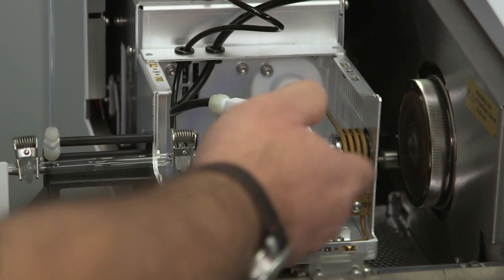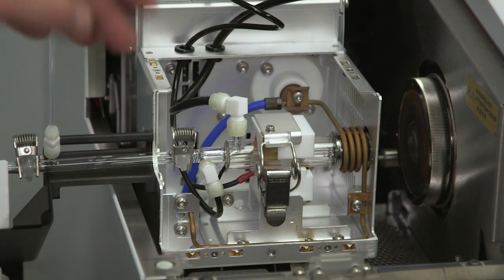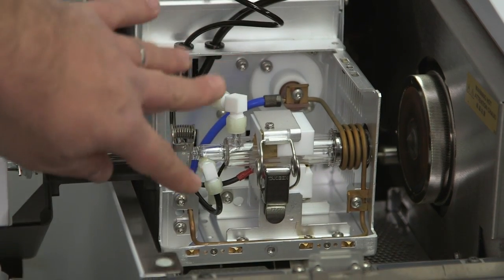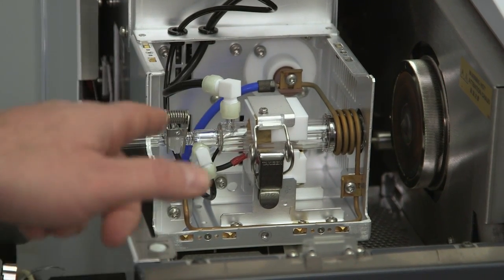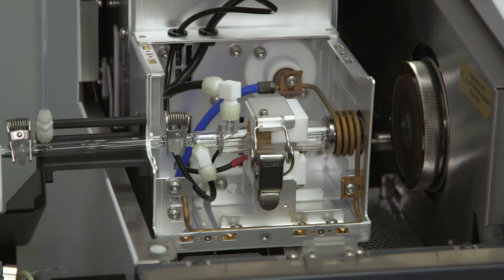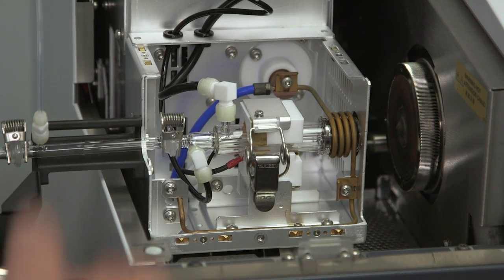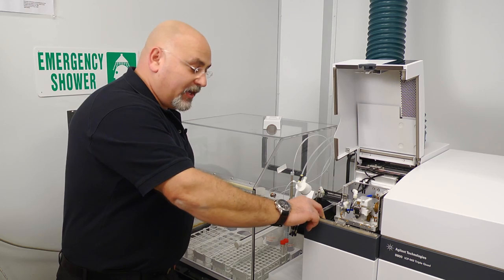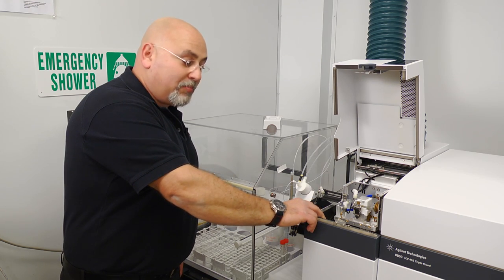We are then looking at the torch and we see the two gases. One is the plasma gas and the auxiliary gas. Fairly simple, all really easy to dismount and mount back.